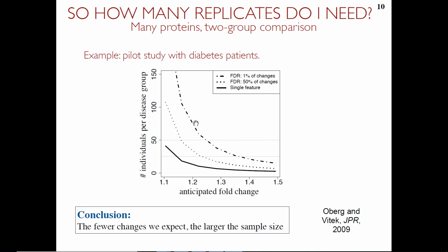I think there was a question. It was a comment, because it's statistical from the mathematical point of view. It totally makes sense, but for biologists, I'm more interested not in the structural proteome, which is like the top 500 here, where you will really find the changes. But biologically, I'm more interested in low abundant proteins, which are at the lowest. This is not a problem at all, but you know what it means. You have to have a sample set that would allow you to do that, right? I just want to point out that by ignoring the lower abundant proteins, we will discover fewer.